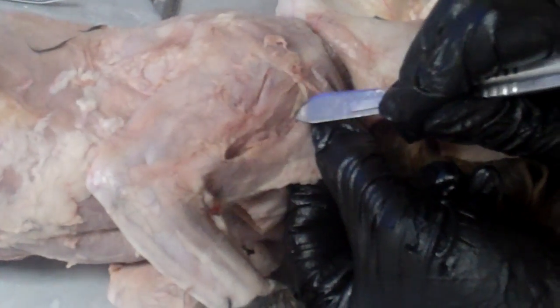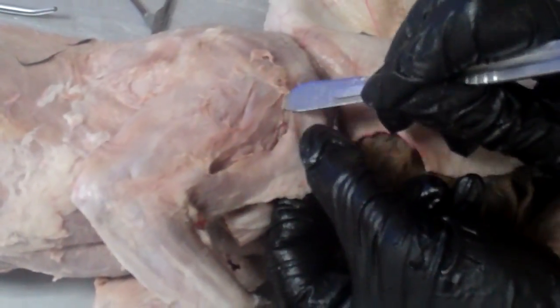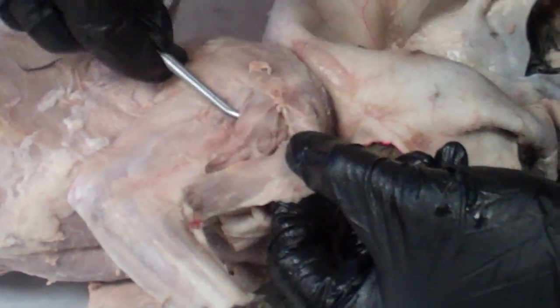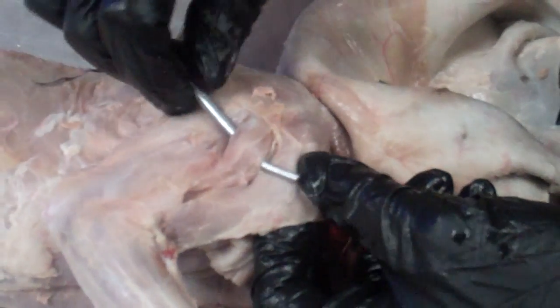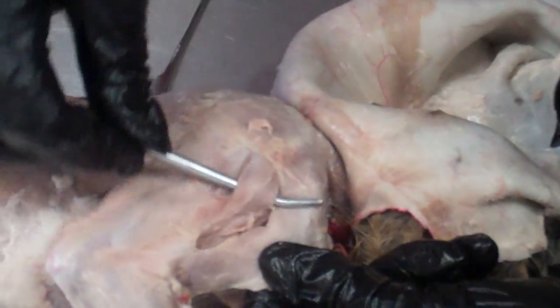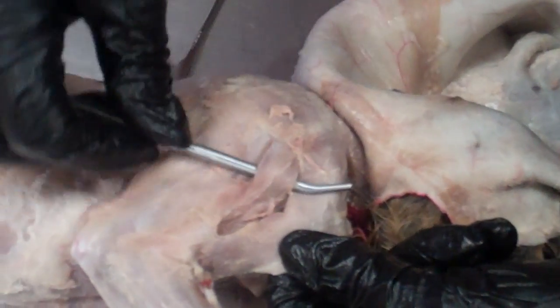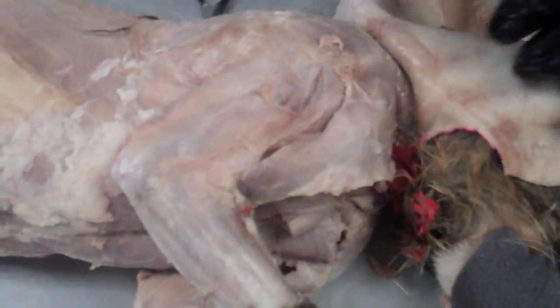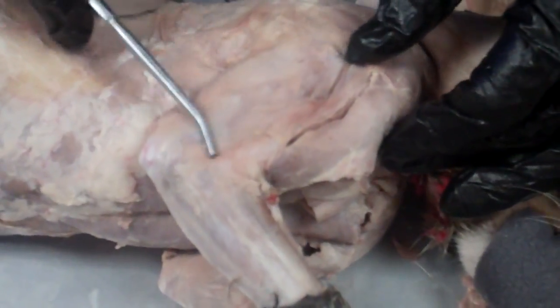Looking from the other side, I can see a line where that would come through. If I take my probe, I should be able to come underneath that. This is the acromiodeltoid, and this is the clavodeltoid. Now I'm going to look for the spinal deltoid.